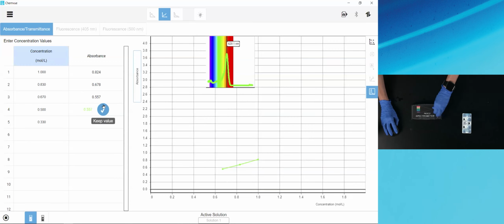So next, you can see that we've got a Beer's law curve forming here. Concentration and absorbance are directly comparable, which means that we could set up this calibration curve here and figure out the concentration of an unknown concentration of this blue solution.